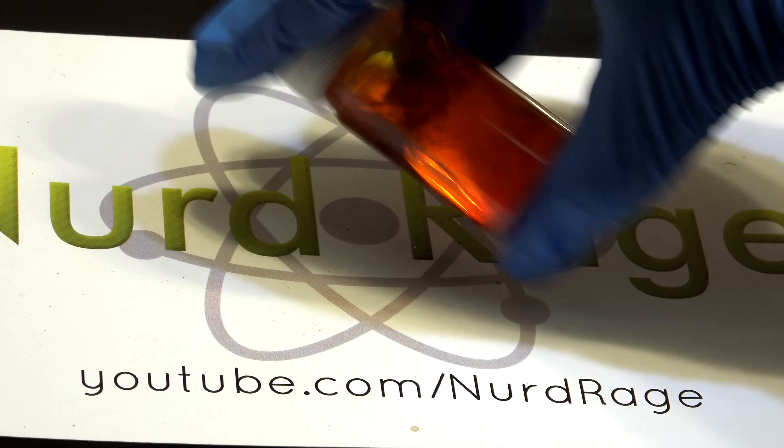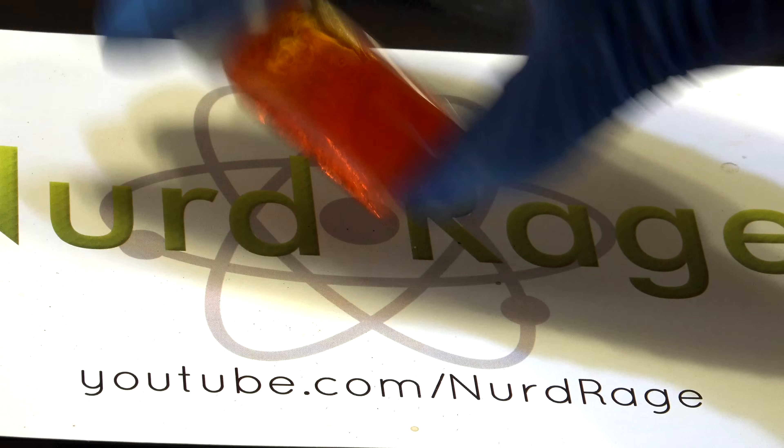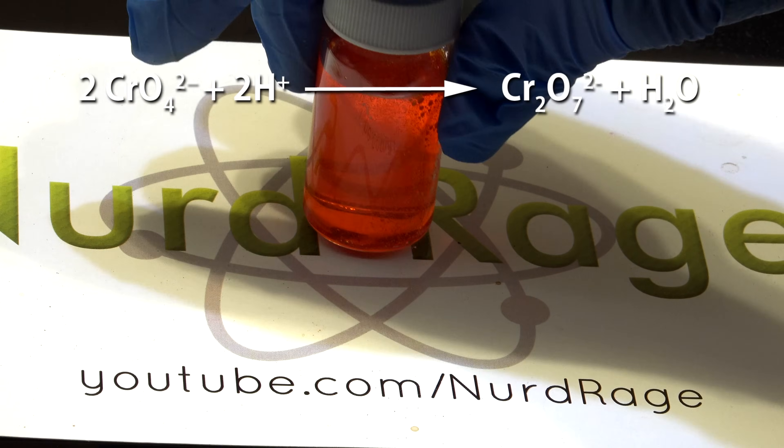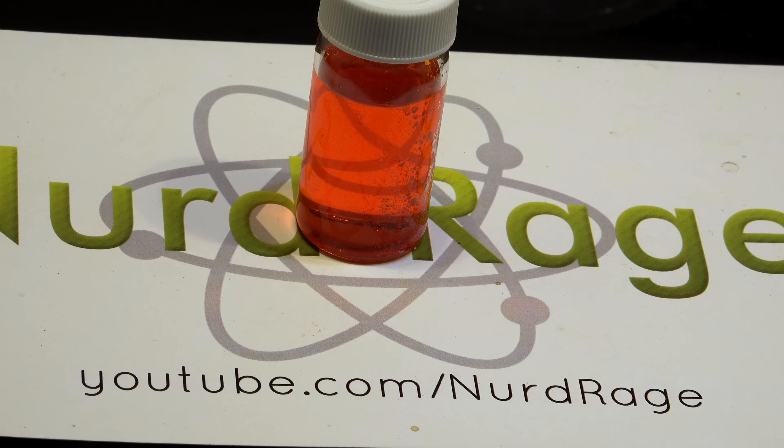We want a solution of dichromate ions, but we can use chromates because under highly acidic conditions the chromate ions convert into dichromate ions. And there is our test solution.